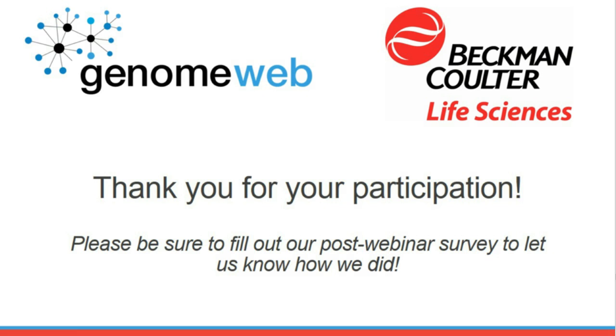And for Echo dispensing, should the source and destination plates always be flat-bottomed? That's another great question. The source plate should be an Echo-qualified source plate and flat bottom because of the way ultrasound transfers through the plate to focus on the meniscus of the liquid inside the source well. However, the destination plate can be any SBS standard 96 or 384 well plate, as long as they either have adapters to hold the plate if it's semi-skirted, or if it is fully skirted, we can work with it.